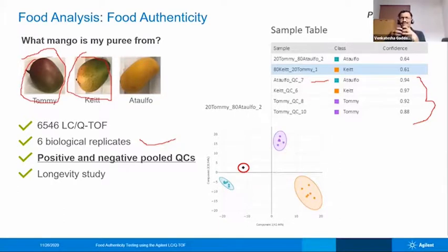And when you mix these together, that means it is adulterated, right? It will show outside of these 3 groups. Okay, it does not belong to any of these groups. So by this way, you should be able to tell whether this sample is adulterated or not. So QCs are very, very useful to make sure that whatever model you have built is working.